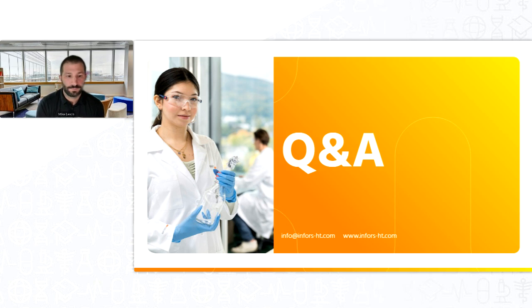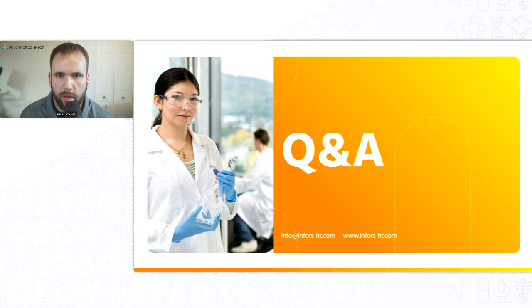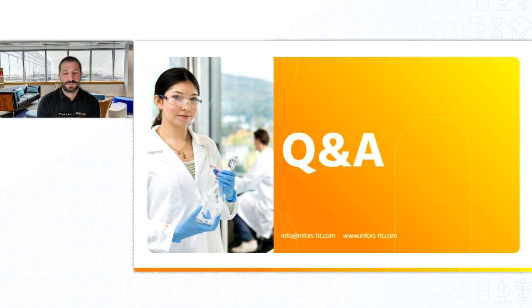Beautiful. Thanks, Mike. Could you talk about what kind of water you're using for the humidity? Is it distilled, tap, autoclaved? Yeah, this is a really good question. A lot of times this gets overlooked. A lot of times customers will assume that they want to use the purest available water possible. In most labs, that's deionized water or ultra pure water, which a lot of people call Milli-Q water. That's what customers will go for because it's the purest form of water available. But really that water is too pure.